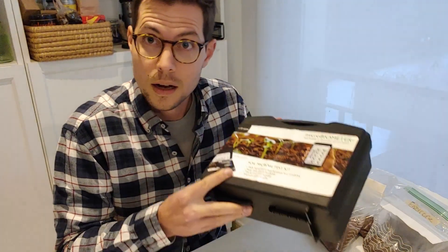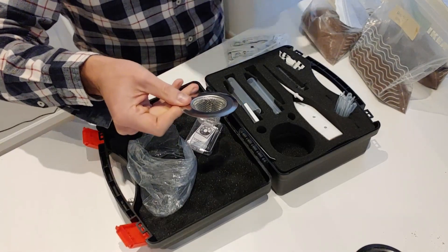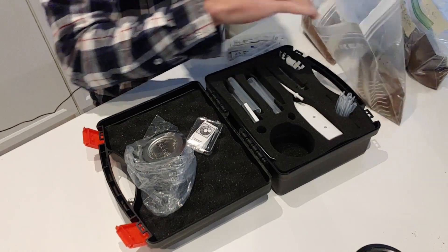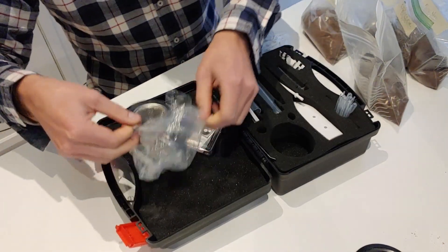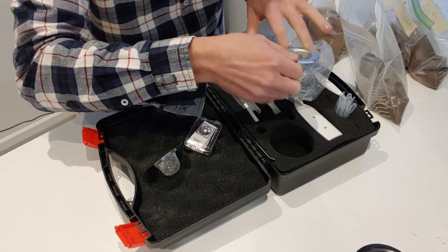Now that I've got all of my soil samples from out in the field and I've got my test kit here, let's get started with the process. The first thing to do is to put a bit of soil into these sifters, because you want to get out any of the debris that you weren't able to remove before. I'm doing this over the plastic bag so I don't get it all over the rest of the kit.